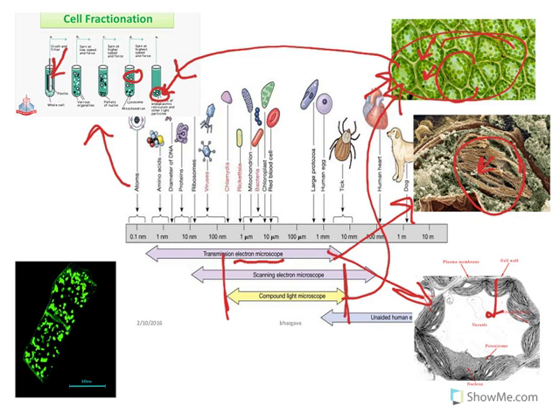Another type of technology that we use to put all the pieces together, it's like one big puzzle, it's kind of fun, is this. It is fluorescence. And we have the technology now. It actually comes from a jellyfish, so jellyfish glow. We can take the protein that glows in the jellyfish and put it on a marker in a cell, a piece of a cell.